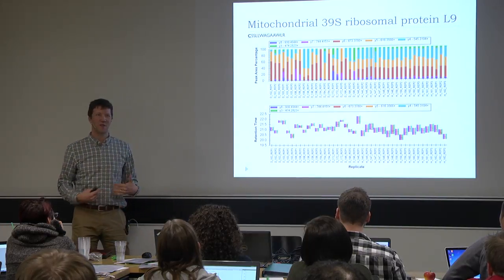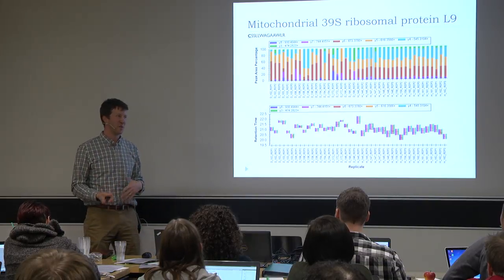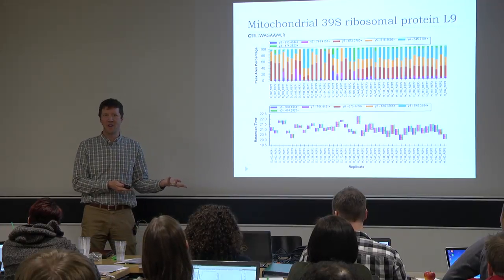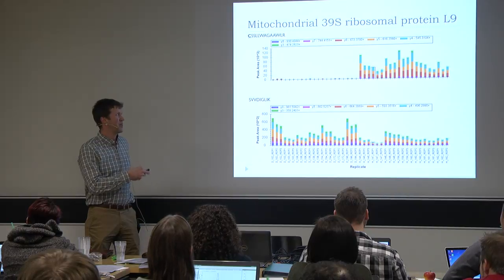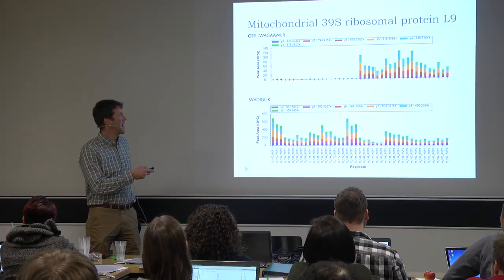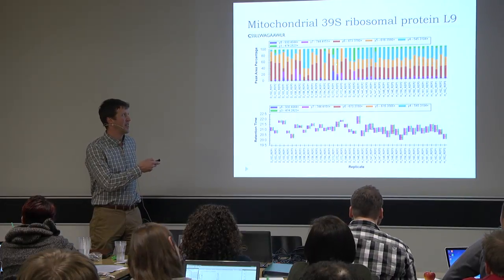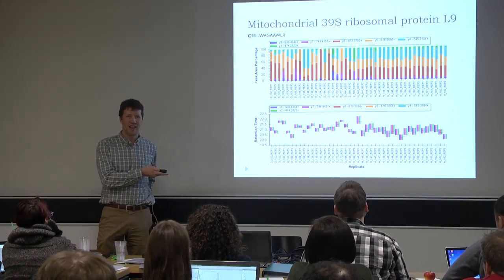Not really. So this is why Skyline's ability to do directed interrogation is really important. We want to be able to look at the chromatograms and see if we can understand what's going on. Well, first we'll denormalize. I already gave you a hint last time: if you see higher variance on one area and lower variance on another, it's probably because it's a change in intensity.